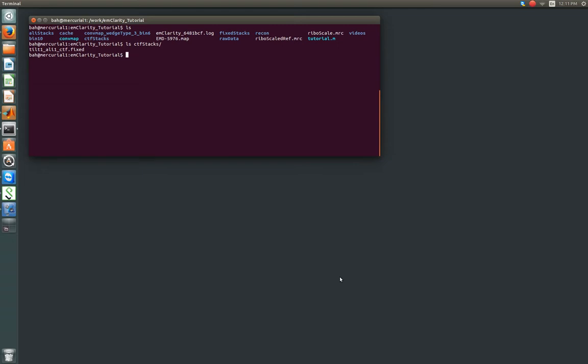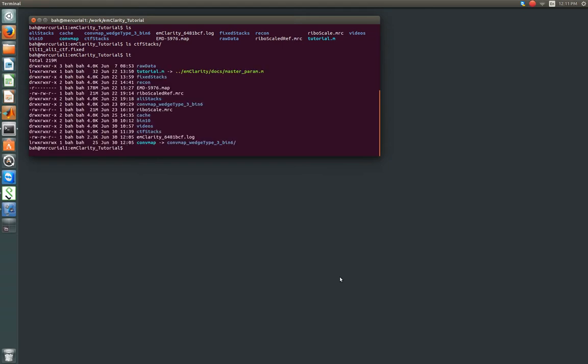Alright, so what we need to set up to move forward, if you hadn't already done this, you need to create a link to the cumulative convolution map, the template matching results directory, that's simply called ConvMap. And again, you can do that with LN with the S flag. And then you put it in this folder, followed by what you want to call it. Now I already have that link there.